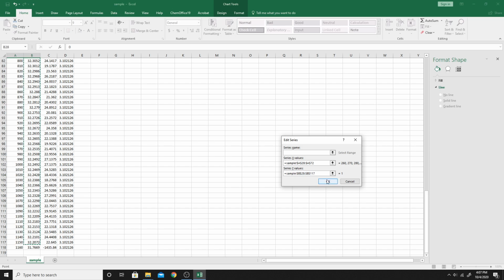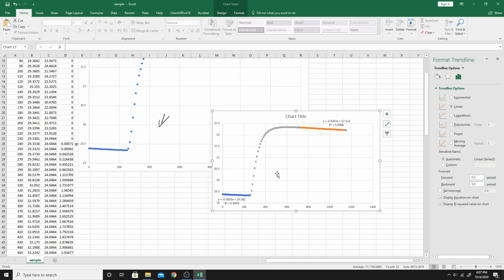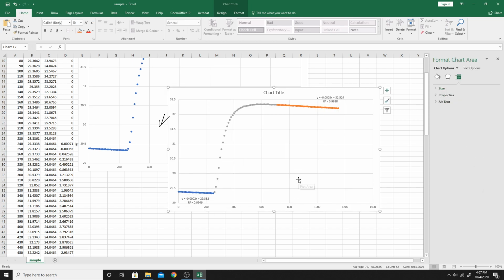And here 1150. Oops, not 1150. Stage 2 ends at 700, sorry, so 700. All right, so 700 here. Okay, go back. So we clearly have 3 stages with different colors.